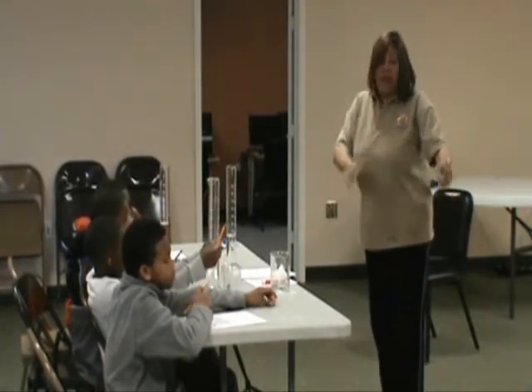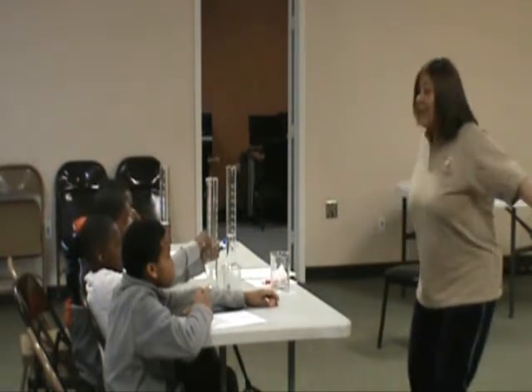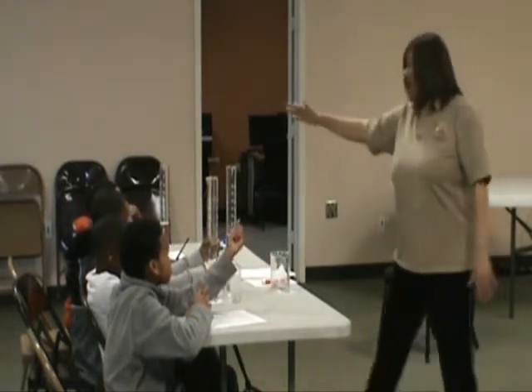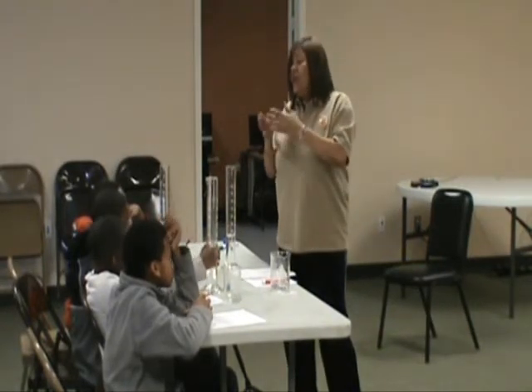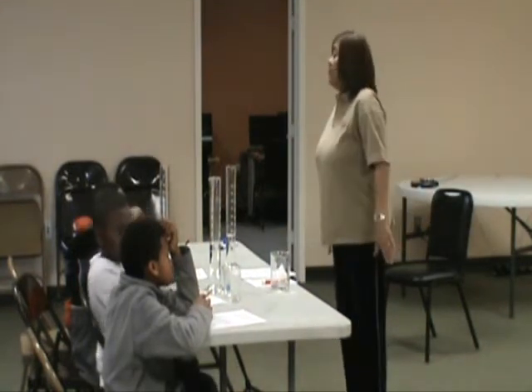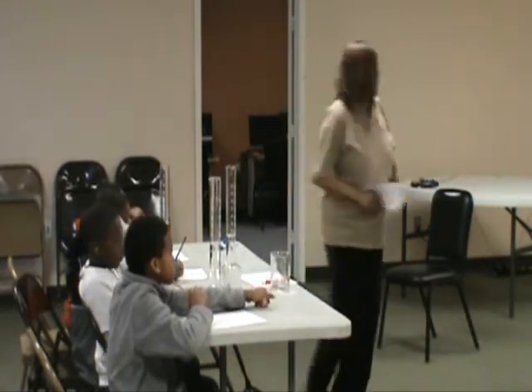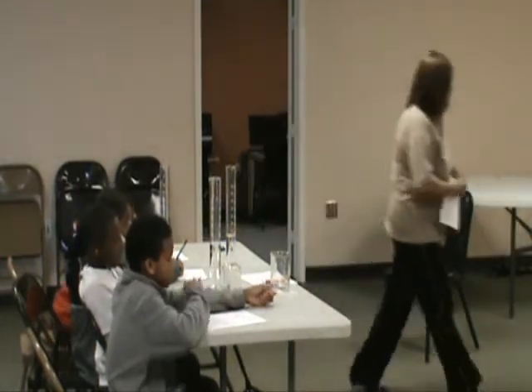Imagine a pool of water. When I jumped in it, where that water was, I displaced it. I moved it, right? Where does it go? It would go around me and up and all over the pool. Inside of this cylinder, today your metal will go in there, and it's going to move the water around. That is called displacement. Now, on the board, I'm going to write, and I want you to look at your data chart while I'm on the board. We're all on number 5.